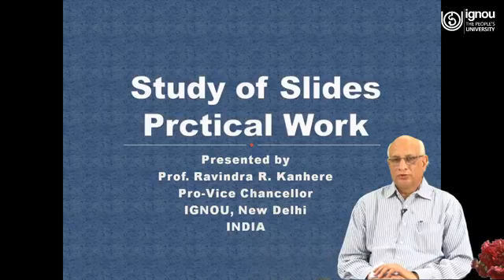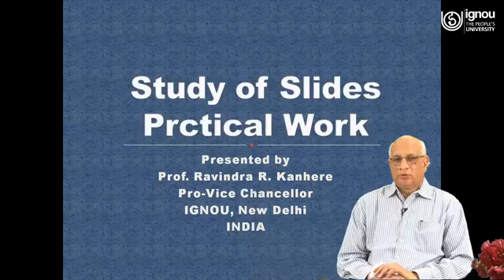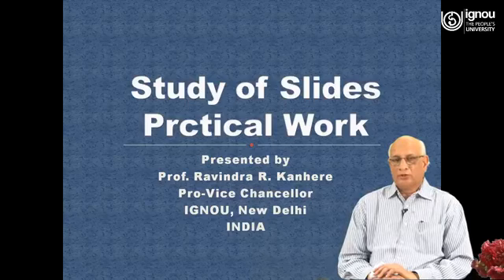In zoology practicals, spotting is a very important component. In spotting, students are supposed to comment on spots which are displayed on the table. Usually 5 to 8 spots are given to the students and the allotted time for each spot is about 3 minutes. But any student can write a comment on the spot only if he is aware of the structure of that particular slide which is displayed in the microscope.